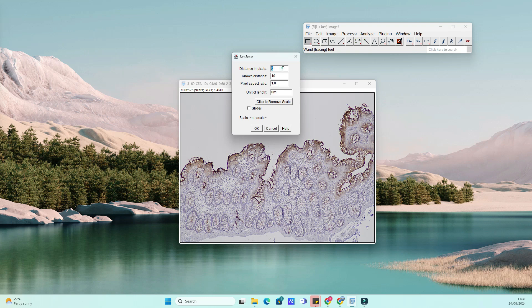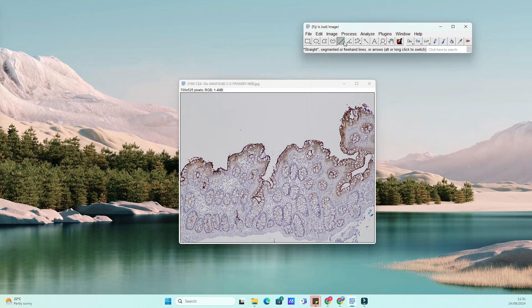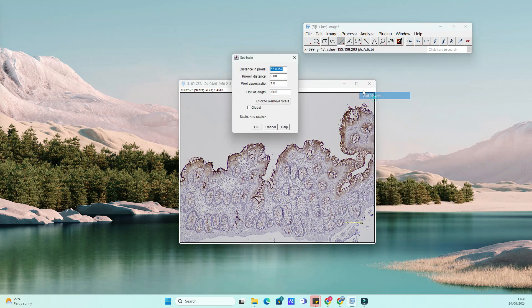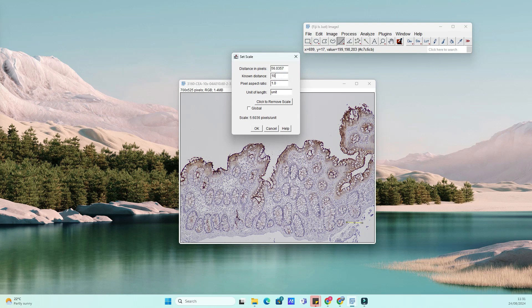Once your image is open, the first thing you need to do is set the scale. This is crucial because the scale bar needs to correspond to the actual dimensions of the object in your image. To set the scale, go to Analyze in the top menu, then select Set Scale.